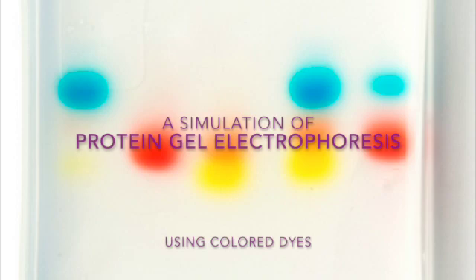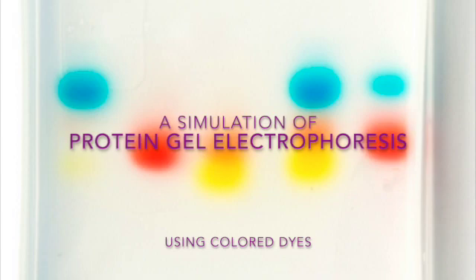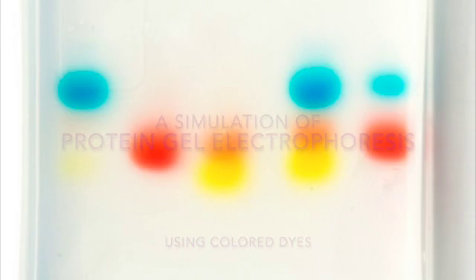Hello, my name is Dr. Randi Papke and today I'm going to be doing a quick demonstration on how to do protein gel electrophoresis. Today we're just going to be doing a simulation of protein gel electrophoresis using different colored dyes. On the screen you see almost rainbow colors. We're only going to be using two colors to represent the two different alleles that a gene might make proteins of. So let's get to it.